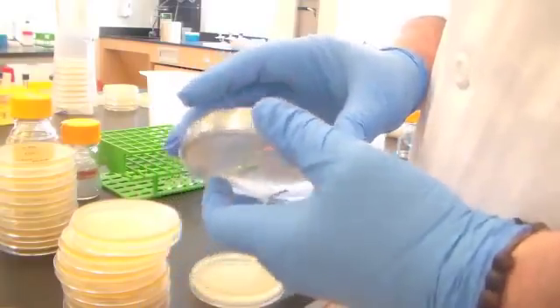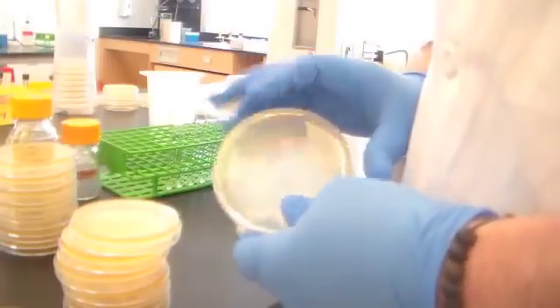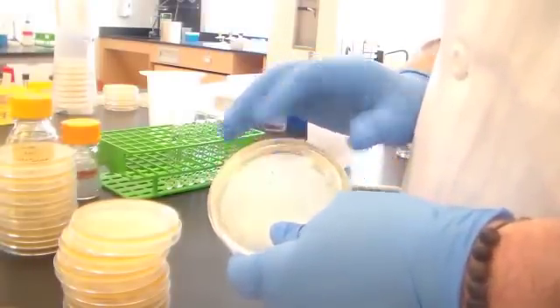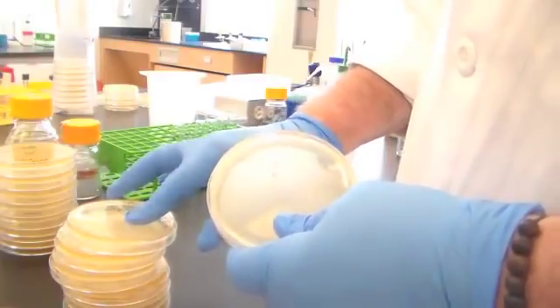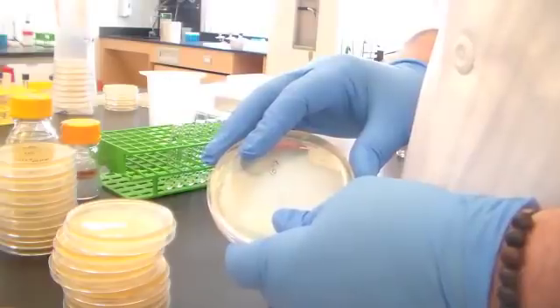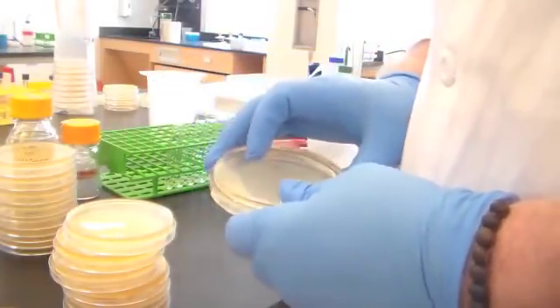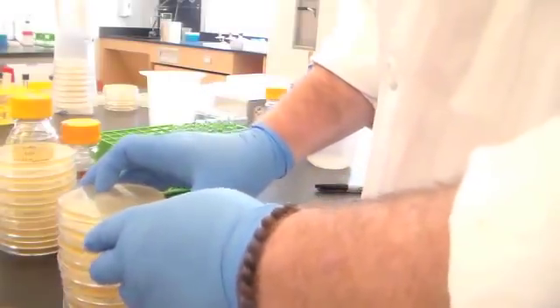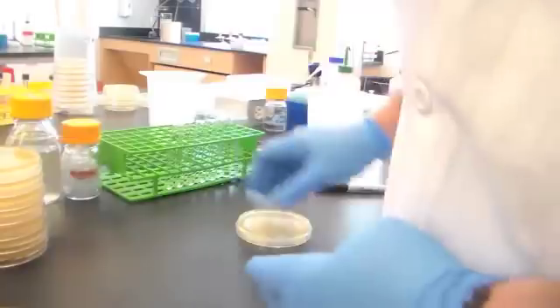So we've eventually diluted out beyond where the culture is. For your time points, you're only going to go as far as 10 to the minus 7. This was an overnight culture that had grown to high density. So I suspect that in this minimal media with glucose or glucose and lactose, the bacterial numbers are not going to reach quite this high a number. So I suspect that the 10 to the minus 7 dilution will be sufficient.